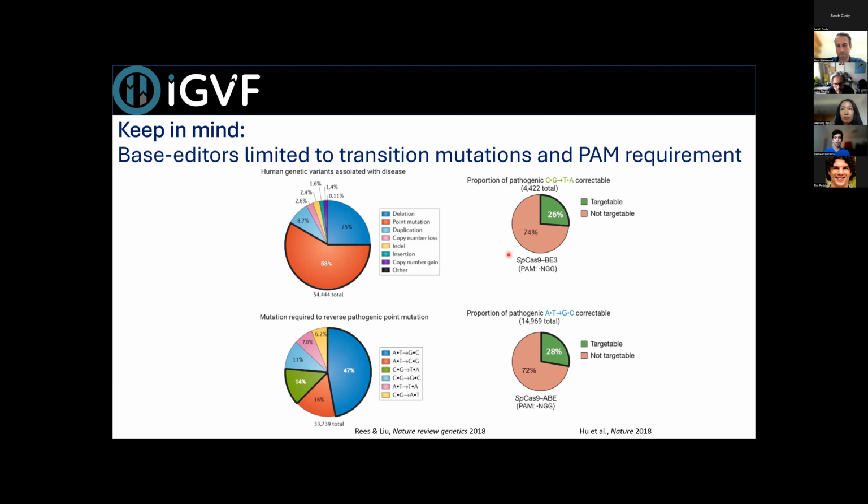And then if we look to see how many among these have a compatible PAM, around 26 to 28% of these variants do have a compatible PAM with wild type Cas9. So this is something to keep in mind in your screen when you're determining which variants you can install or not. And then also, as mentioned, to increase this 26 to 28% proportion, you could potentially use a Cas9 variant with a more relaxed PAM constraint, such as SpG or SpRY Cas9 developed in Ben Kleinstiver's lab.